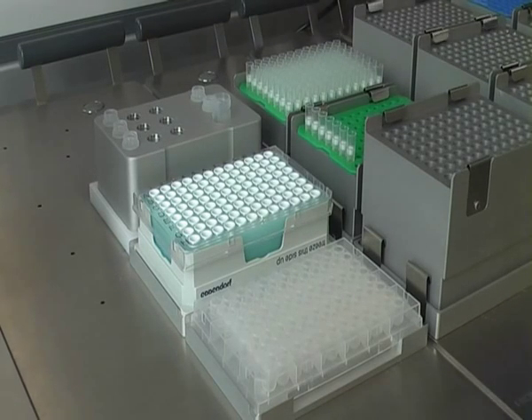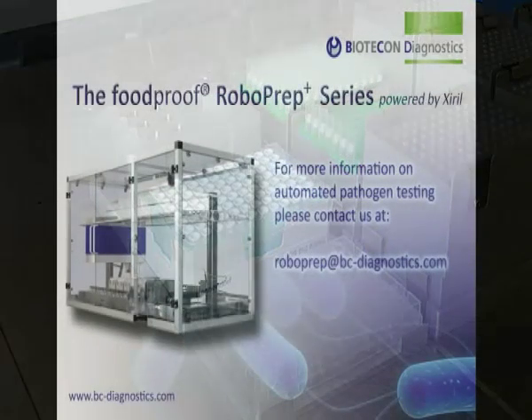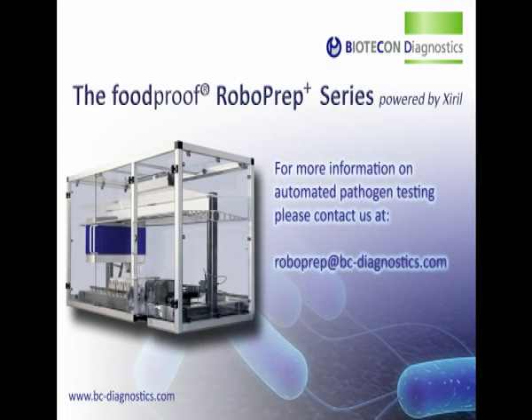The PCR plate need only be sealed manually and transferred to a real-time PCR instrument, where the rapid amplification and detection takes place. This automated process of setting up the PCR plate takes just 20 minutes for 96 samples.